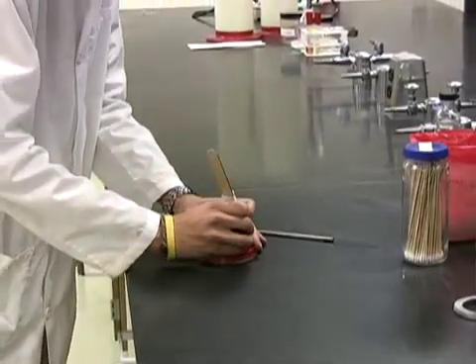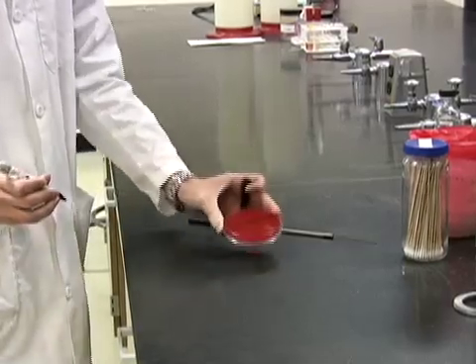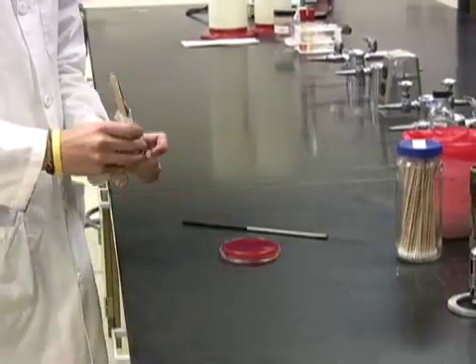In this lab, you will have your throat swabbed and swab your partner's throat in return. Collect one BAP plate and divide it in half with a Sharpie.